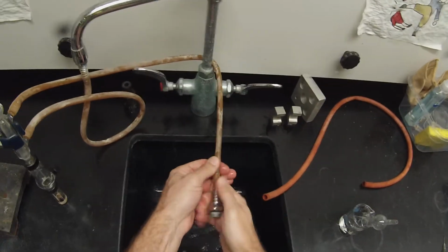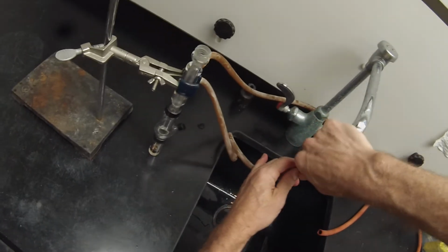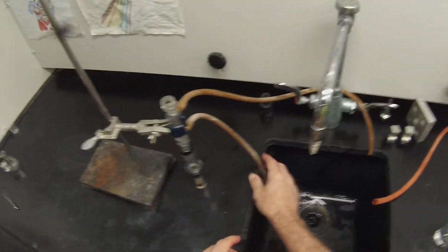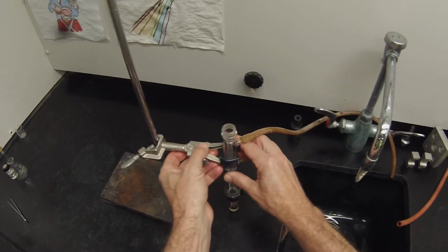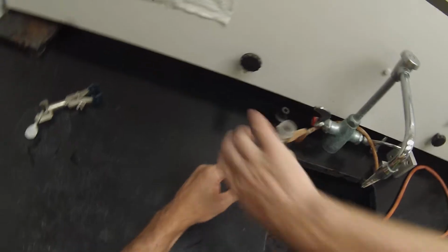One of the many lab hacks to get you out faster. Those guys are cool. Remember to take these off, you just kind of roll it backwards. Makes them come off more easily. Roll it back on itself. I can disconnect my clamp. Take all these pieces apart.